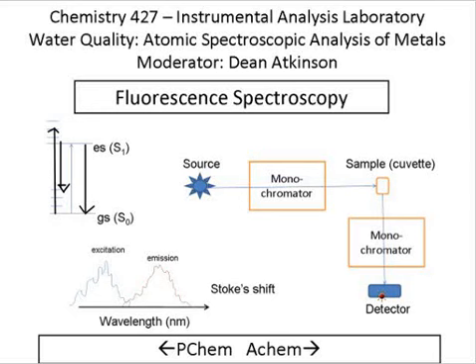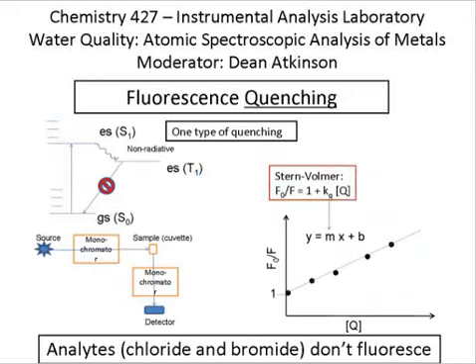There are a couple of tricks that you have to play. It has to be a microscopy, of course, because you have to be isolating one individual molecule in space. And the other thing is that the molecule pretty much has to be on the surface because it can't be moving around while you're shining the light on it. Essentially, this is a microscopy setup that allows you to detect a single photon, and those experiments have been done and are fairly interesting. Unfortunately, what I've just described is a fairly reasonable description of fluorescence spectroscopy and the strengths of fluorescence spectroscopy. It is not, however, the experiment that we're doing here.